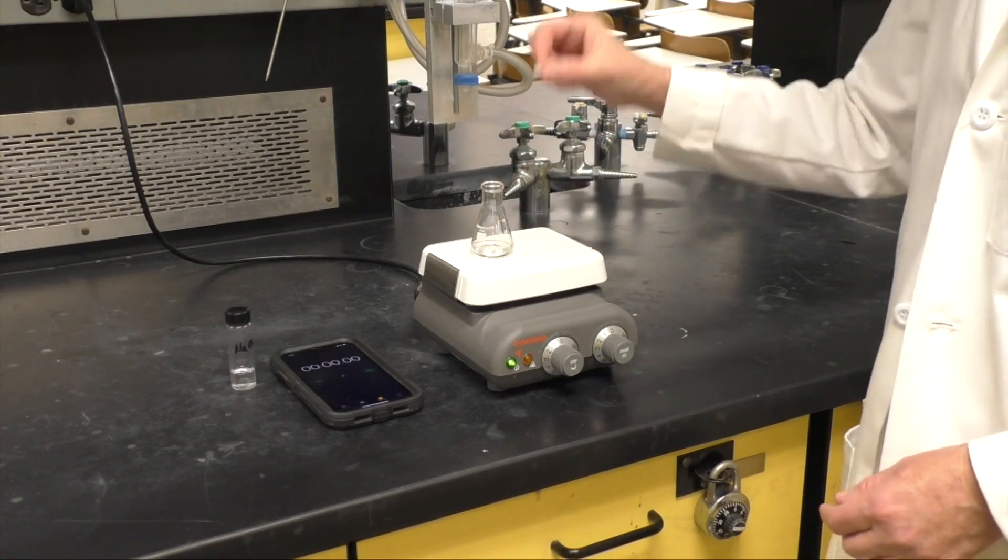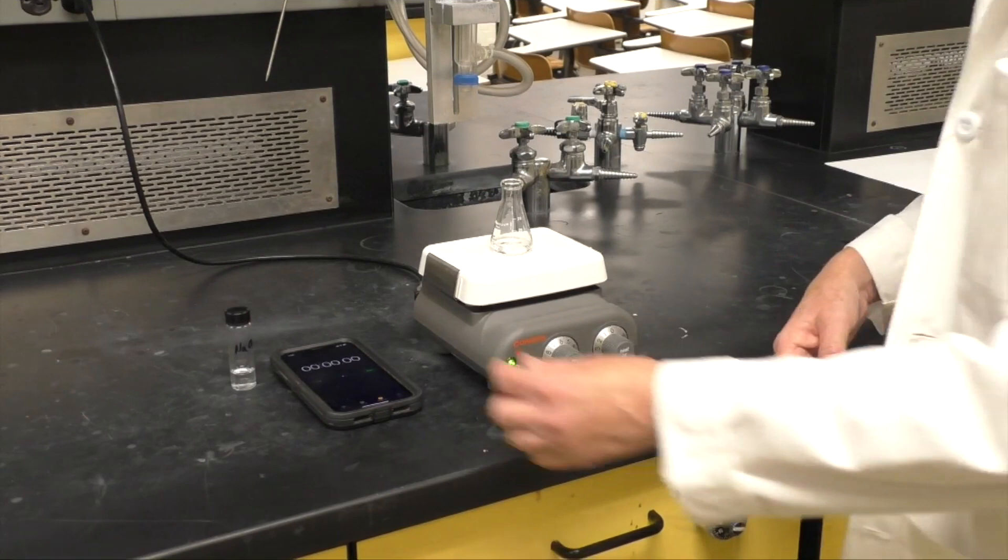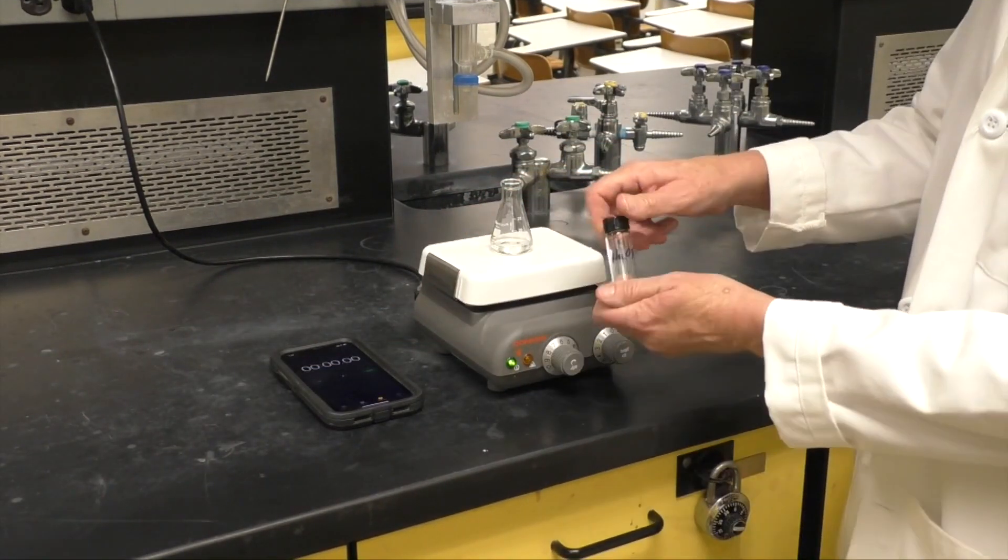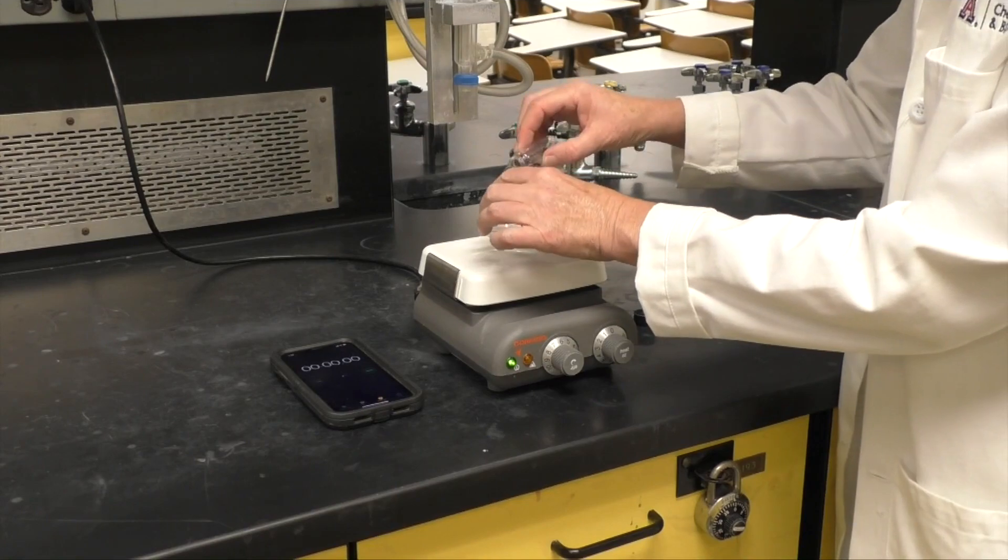Add a stir bar and begin stirring. Have your timing device and observations page ready. Pour the sodium hydroxide into the flask and start your timer.